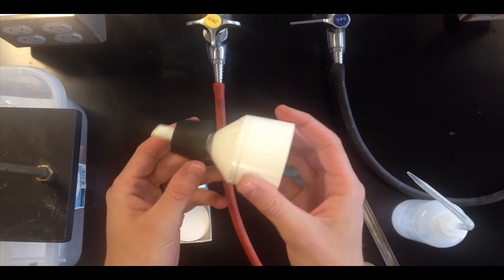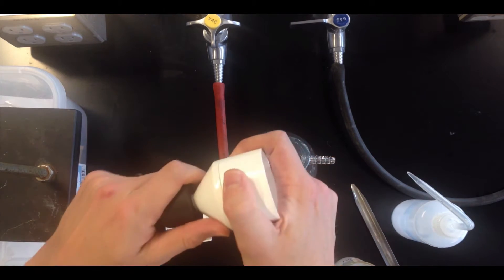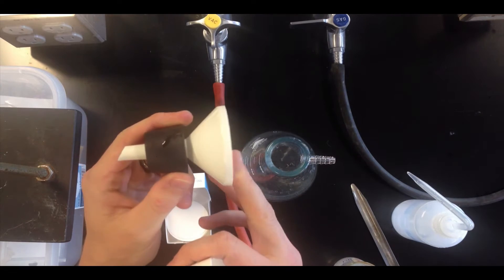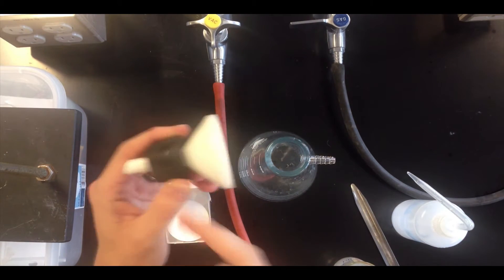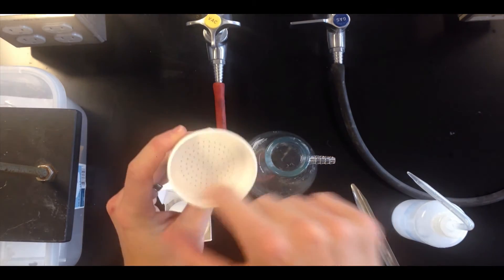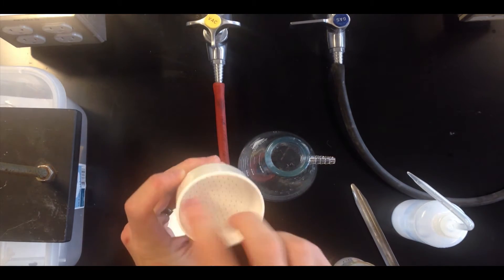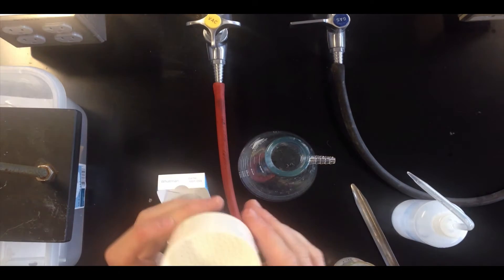The second is a specialized type of funnel called a Buechner funnel. What's unique about the Buechner funnel is, first of all, it's in two pieces. The bottom looks like a regular plastic funnel with a stopper that fits the filter flask so that we get a good seal there. And the top part is a cylindrical piece with holes in the top. So these holes are actually big enough to let solid pass through, but we're going to put filter paper on top of those holes to make a good seal there.